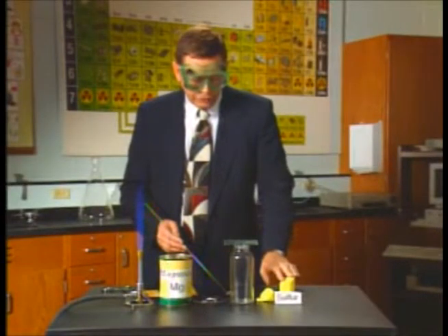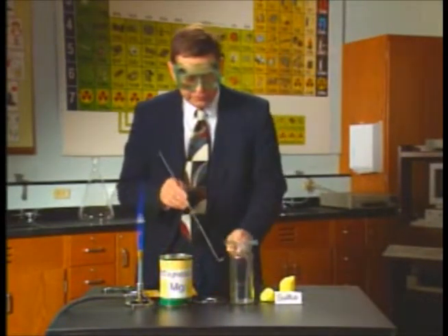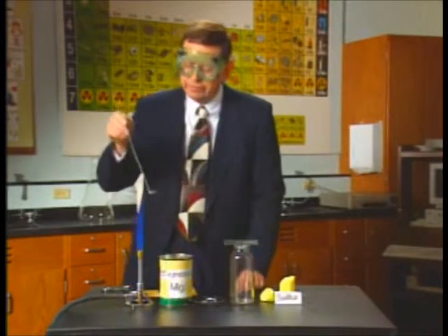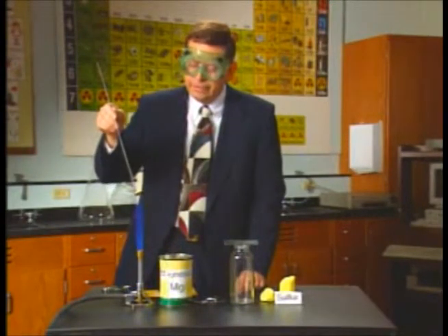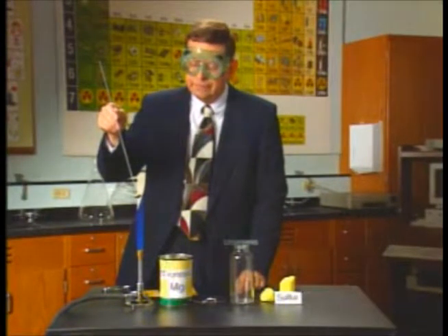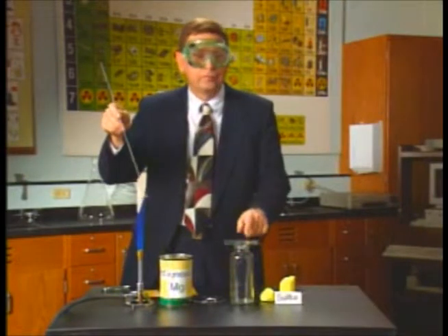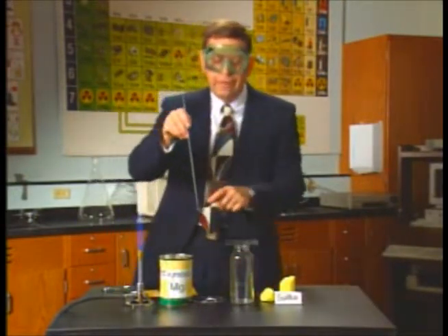Here we have a piece of roll sulfur. We can take a small piece and place it in the deflagrating spoon. We're going to heat it in the spoon and the sulfur will melt and ignite. Then we're going to lower it, once it has ignited, into this bottle of oxygen gas so that the flame will be more visible. Sulfur burns with a lavender flame producing sulfur dioxide gas, SO2.